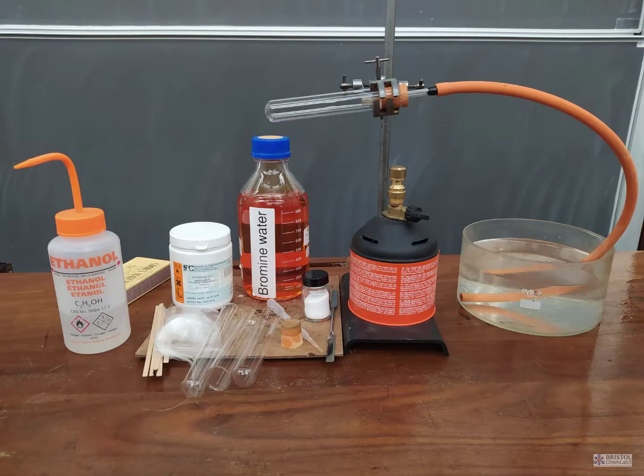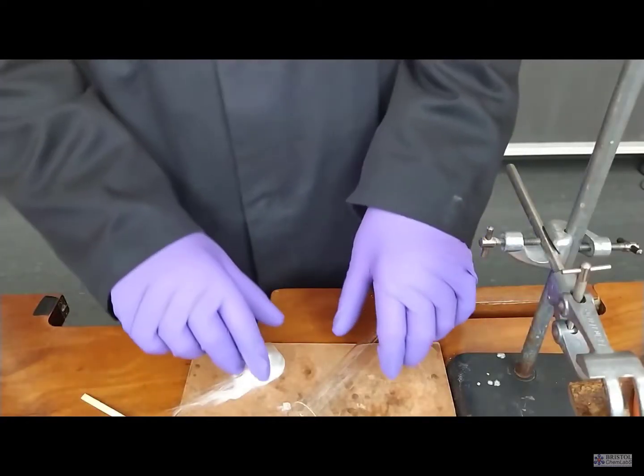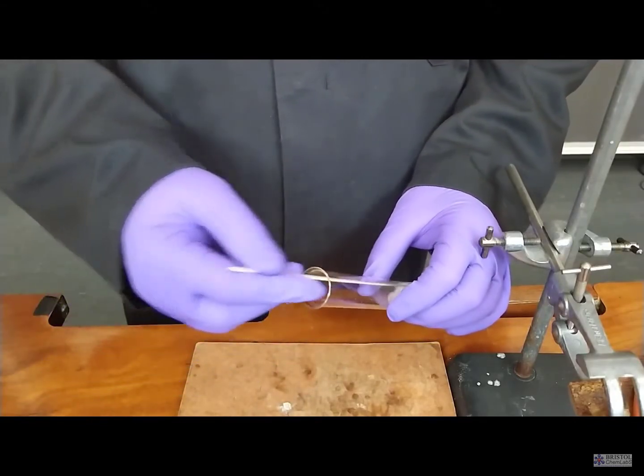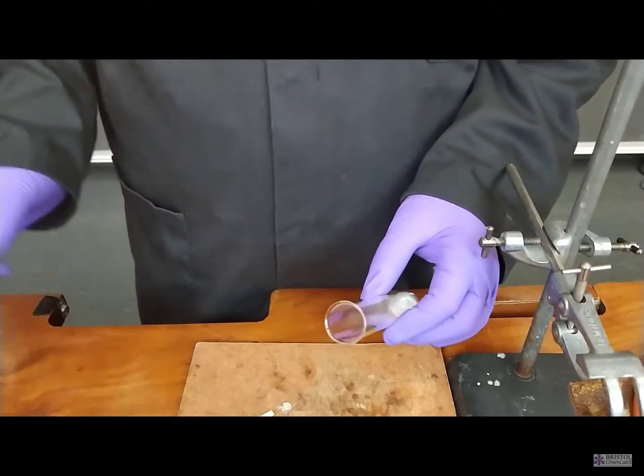Glass wool or mineral wool is used as a reservoir for the ethanol. Because the tube has to be tilted on its side, you can't simply pour the ethanol in.